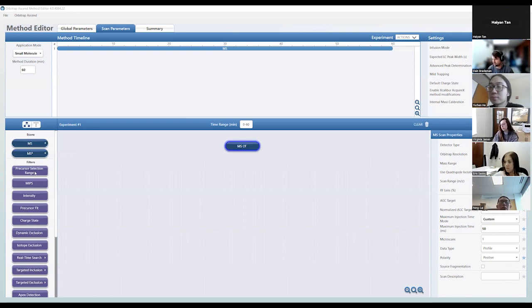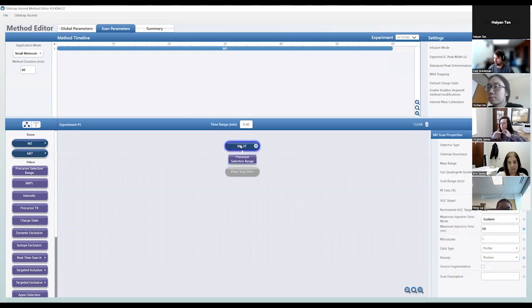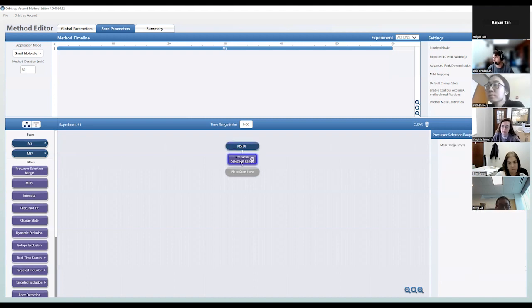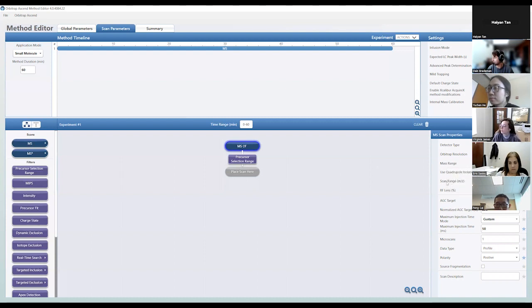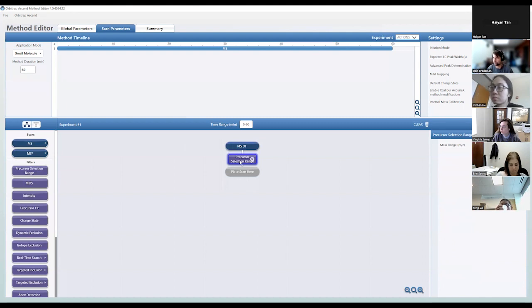For DDA, the first filter I drag over is the precursor selection range. The instrument acquires an MS1 and that spectral data passes through a series of filters before anything is isolated for an MS2. I typically match the precursor selection range to what I specify in the MS1 scan properties — if you're scanning 200 to 1600, you might as well sample things in that range. There are a lot of contaminants below 300 m/z, so it depends on your sample prep and search tolerances.